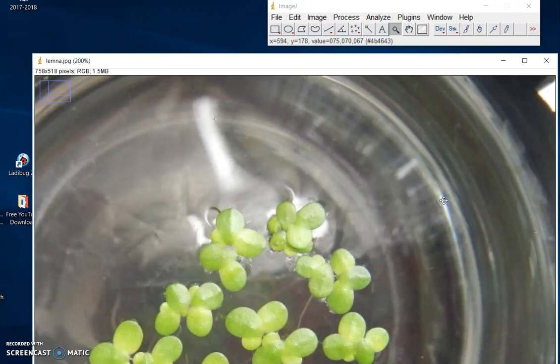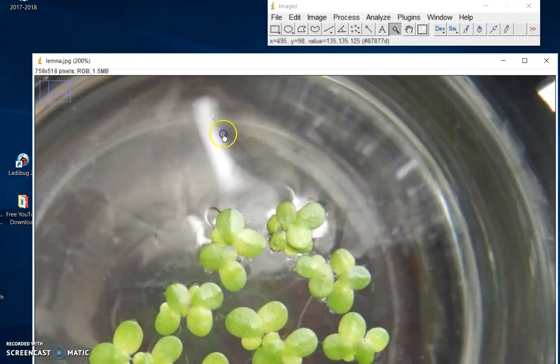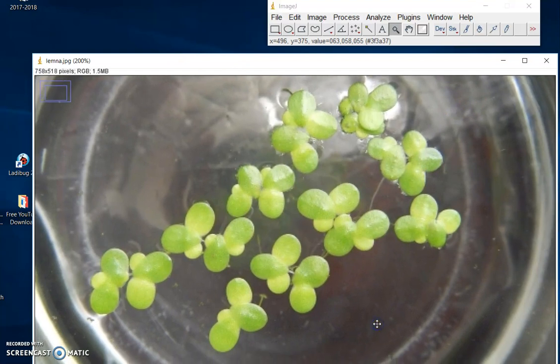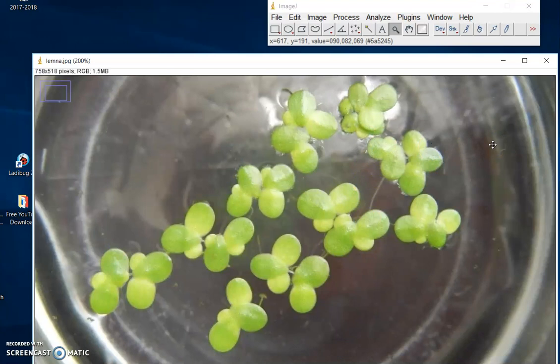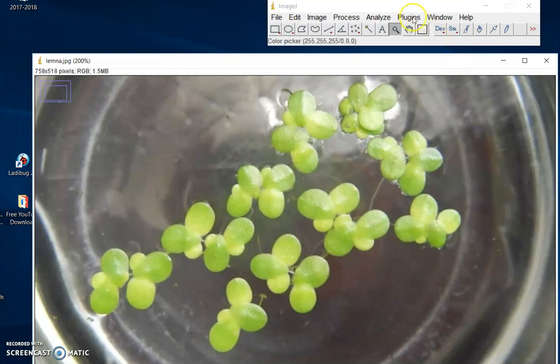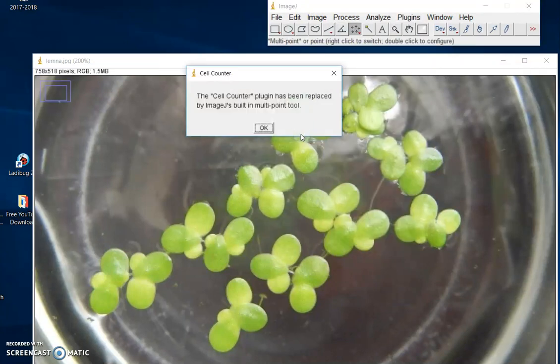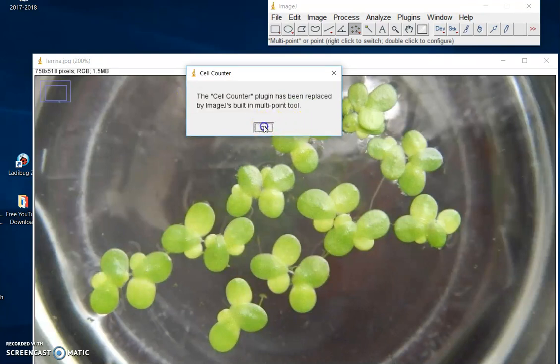Now I'm going to press Spacebar, and my hand comes up so I can actually move these around. A lot of little frogs in there. To get the counter, you go to Plugins, Analyze, Cell Counter. It tells you that it's been replaced by something called Multipoint — no big deal, click OK.